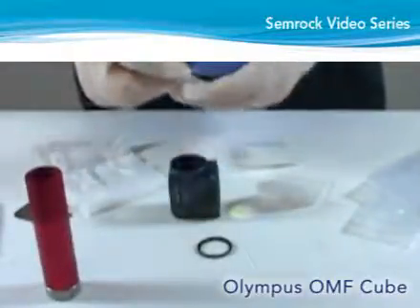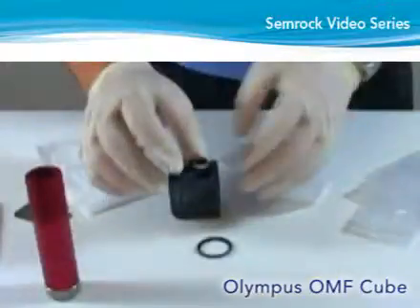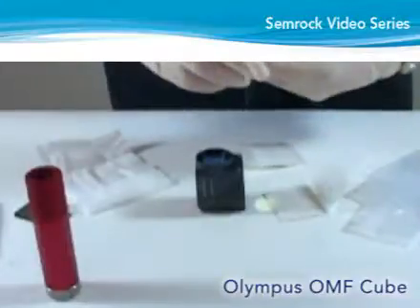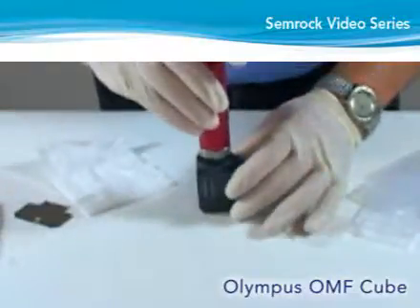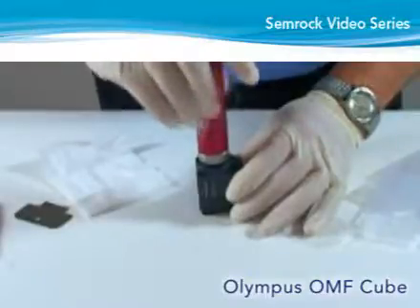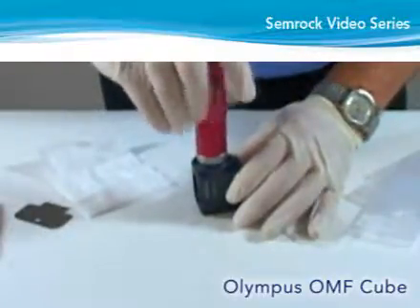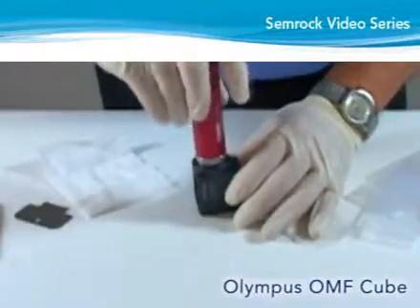Orient the exciter with the arrow on the side of the filter pointing towards the cube, and then place inside the exciter mounting hole. Insert the retaining ring with the open side facing the exciter mounting area of the cube. Following a similar procedure used for mounting the emitter, begin screwing the retaining ring clockwise, but be careful to avoid cross-threading. Using the spanner wrench, carefully turn the ring while observing its position in the threads and keeping the ring level. Tighten the ring snugly against the exciter filter.